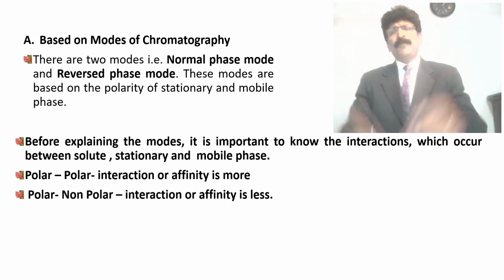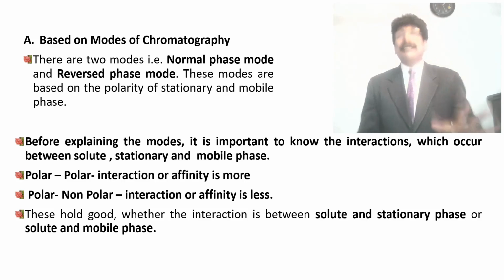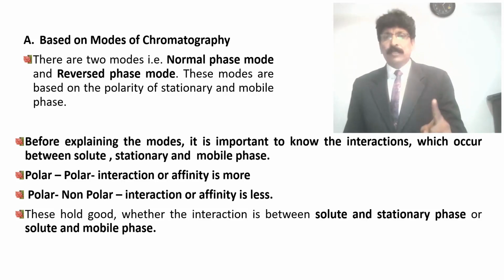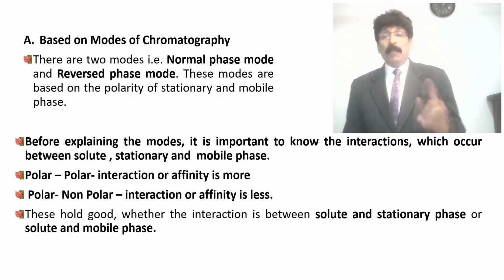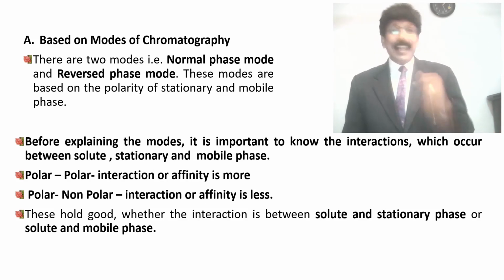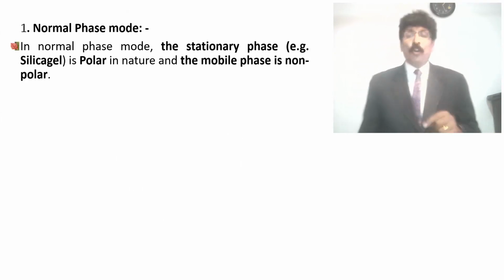This is very common, any student can understand. This holds good whether the interaction is between solute and stationary phase, or solute and mobile phase; the interaction can be easily studied by us. So first, the normal phase mode.